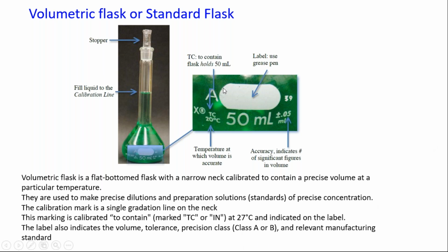And then you have this letter A or B. And here this is a class A. This is the manufacturing standard. And for all accurate and precise analysis, the A grade or the class A glassware should be used.